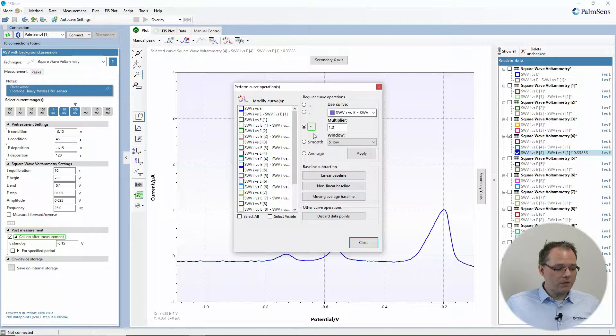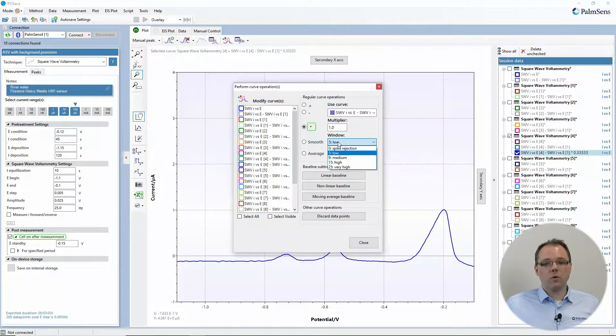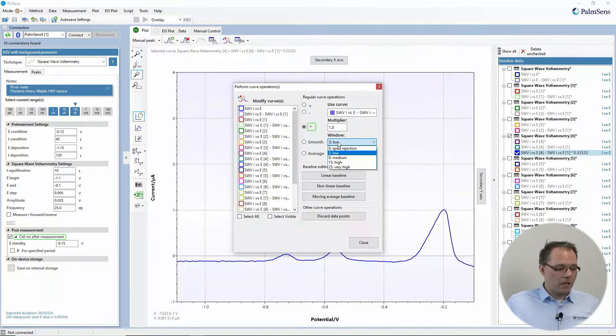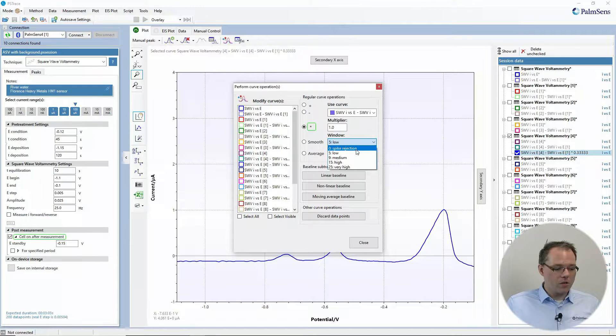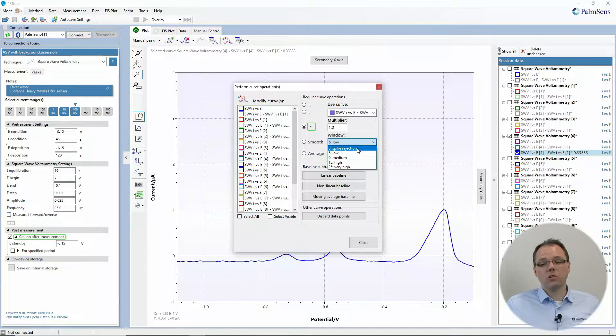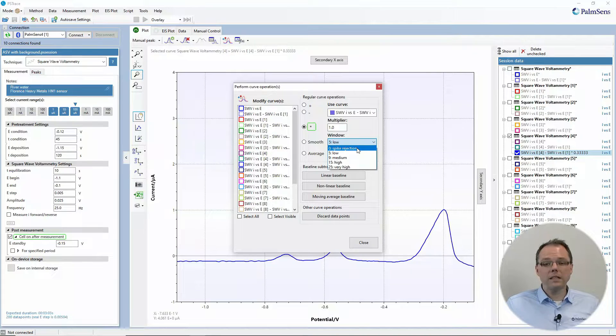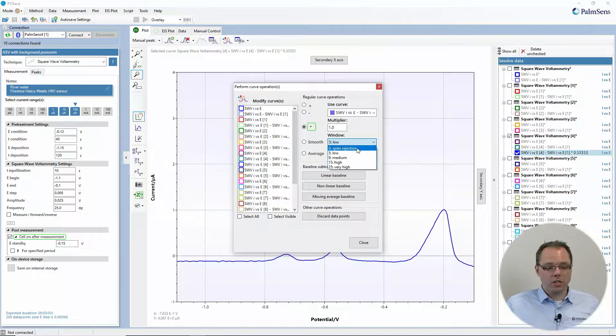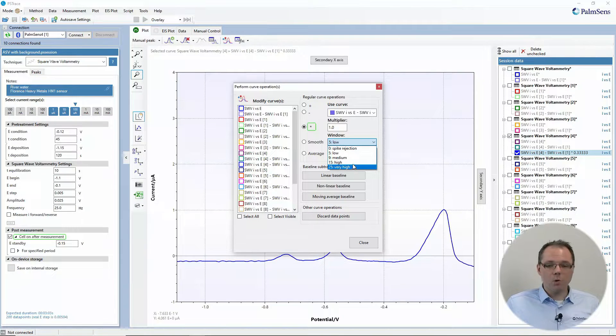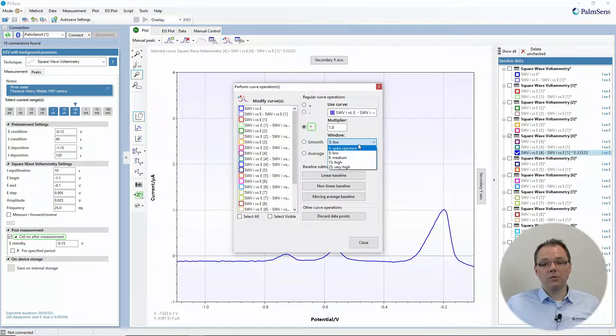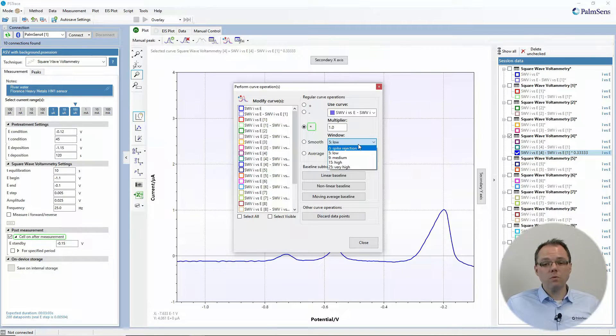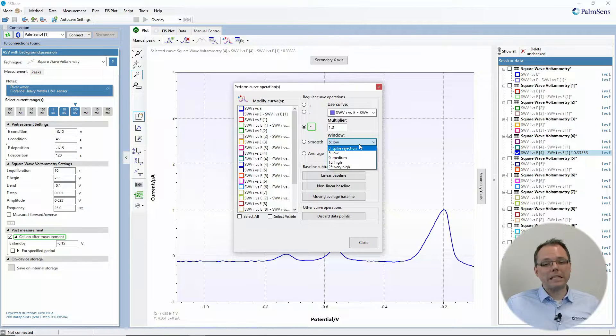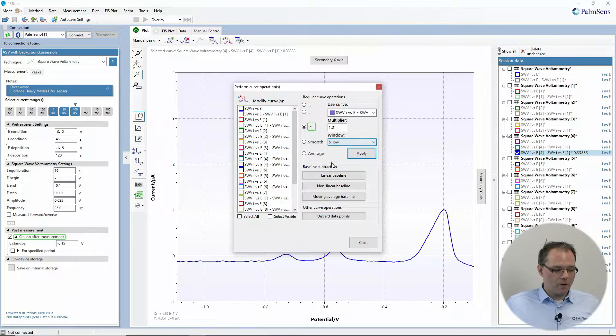What we also have is you can smooth your curve. This is just a regular moving average smoothing. You can choose to have like no smoothing, then you just have spike rejection. This is usually the default for our measurements. That means if there's just a single completely outlying point, it will be taken out of the measurement. Otherwise you can switch on more smoothing, which is nice because it removes a lot of noise, but keep in mind that the more you smooth, the more you remove the peak intensity as well.